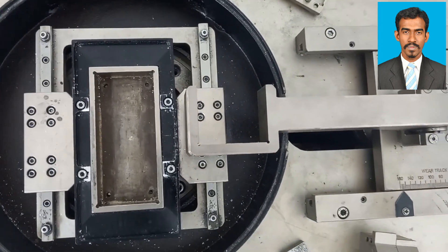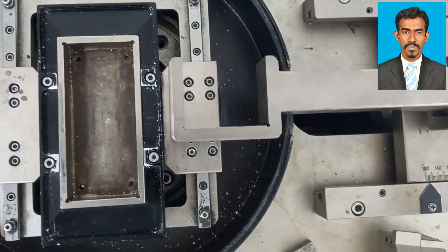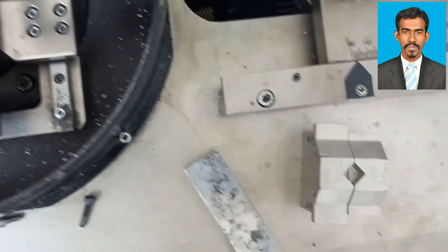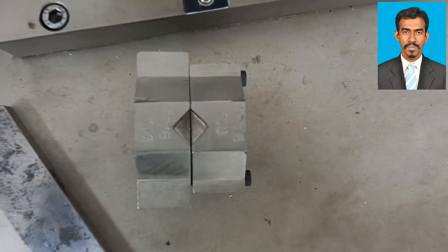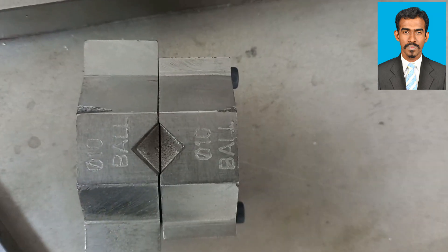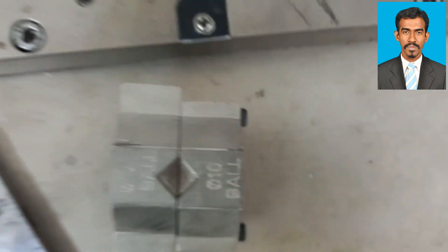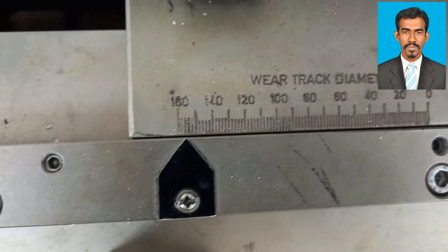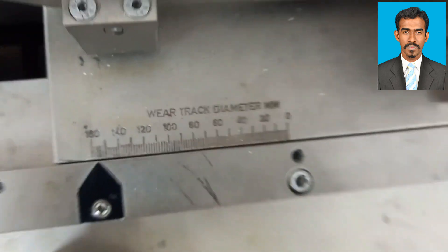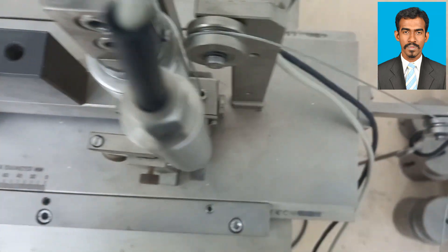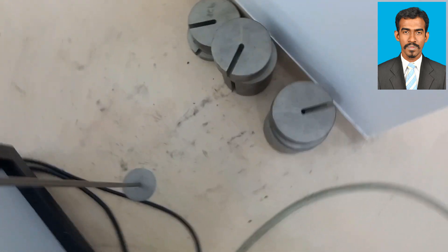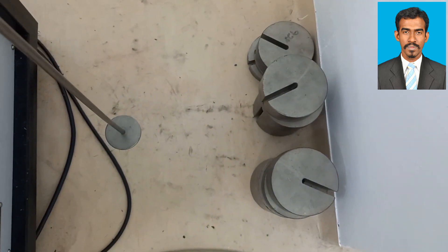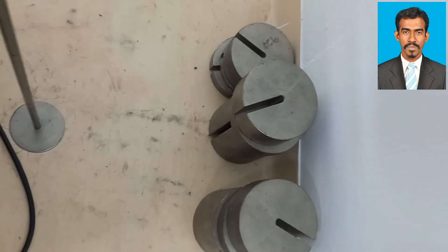A pin-on-disc tribometer is an instrument used to measure the coefficient of friction, frictional force, friction temperature, and wear volume. These tribological parameters can be measured by the pin-on-disc tribometer. It can be operated either with oil or without oil depending on the experimental parameters. Let's see the experiment.